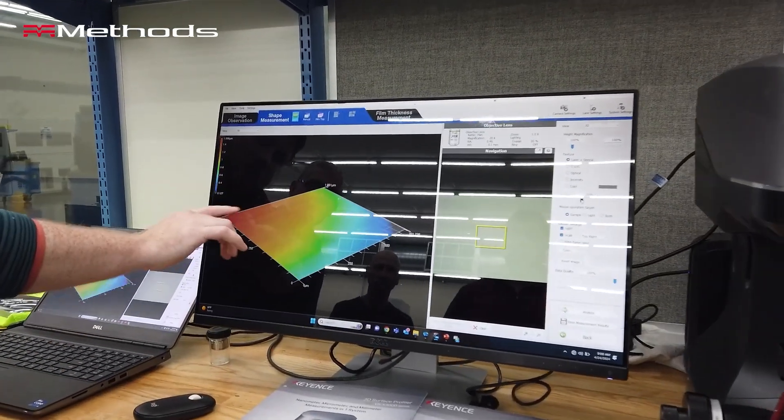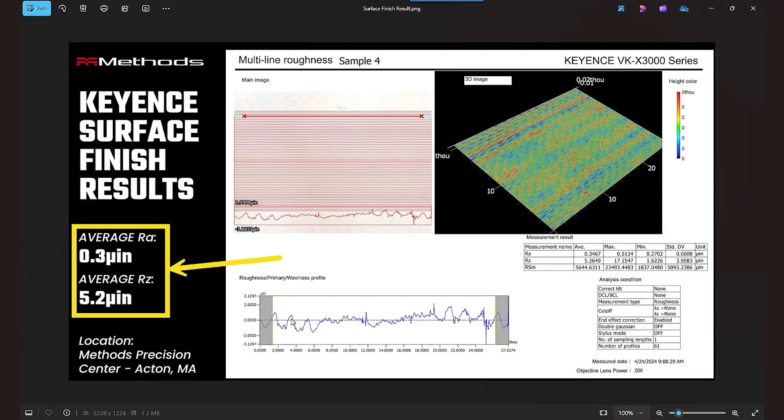The output of that scan — looking at this graph — might kind of seem a little bit meaningless, right? There's a lot of data points across this whole entire spread of the part. We need to boil that down into a digestible, measurable number.